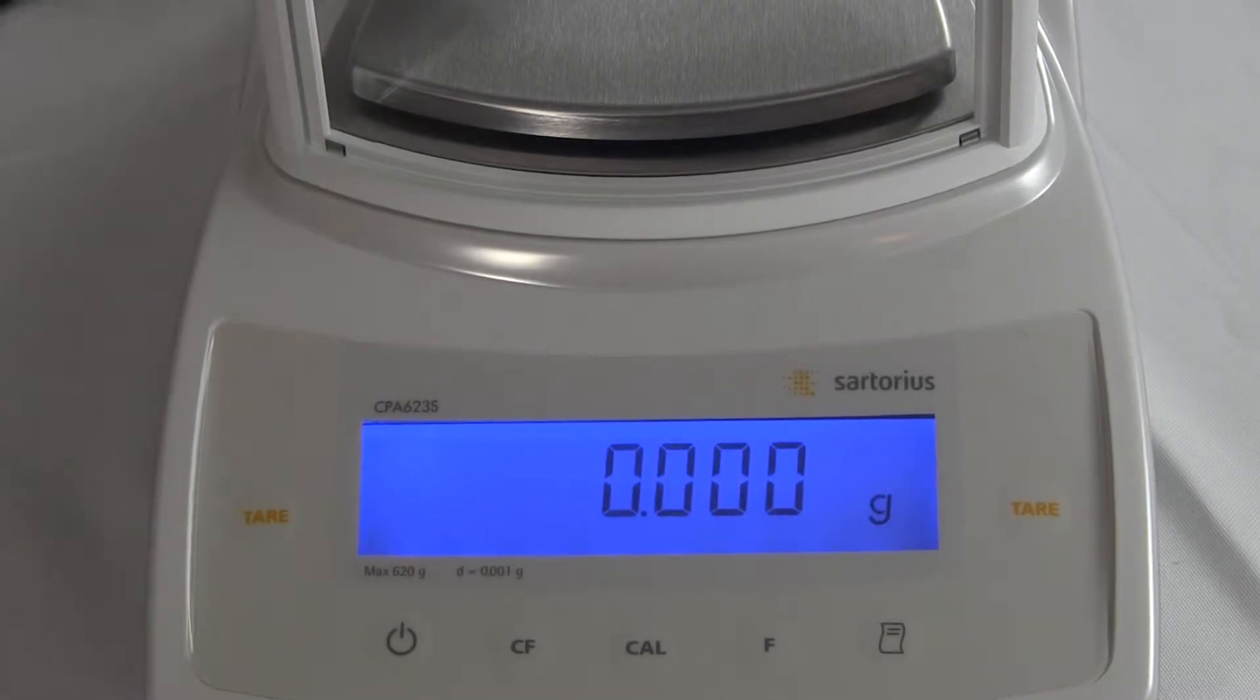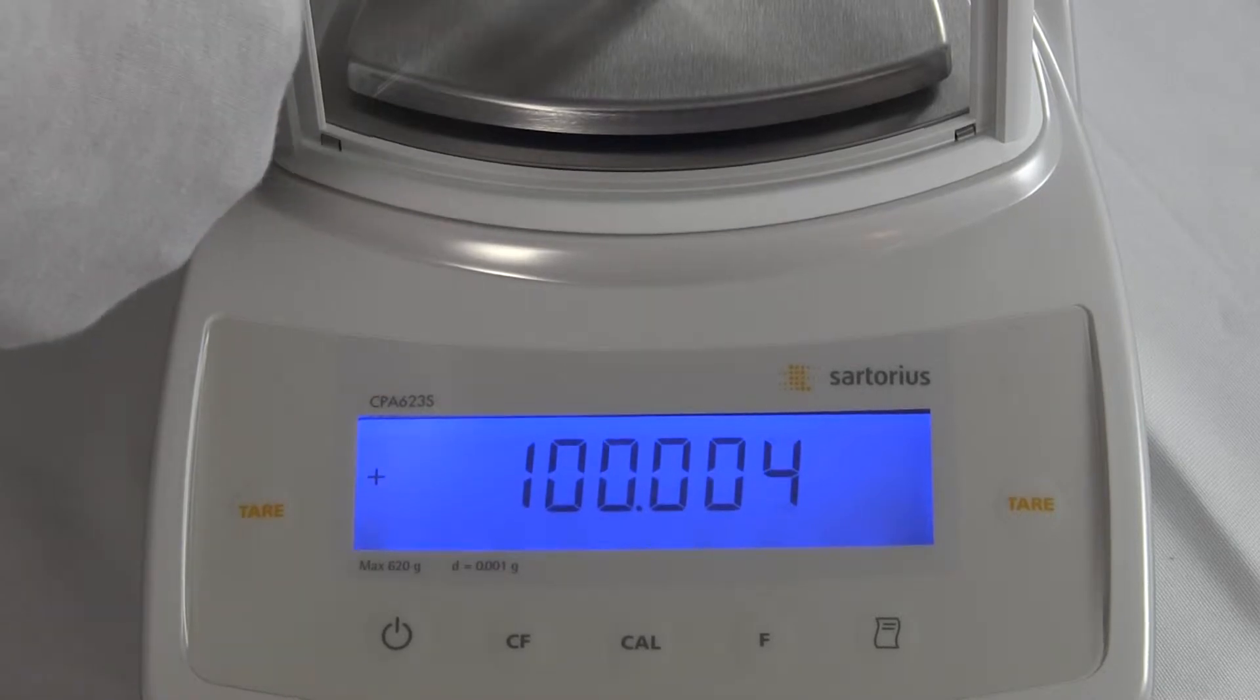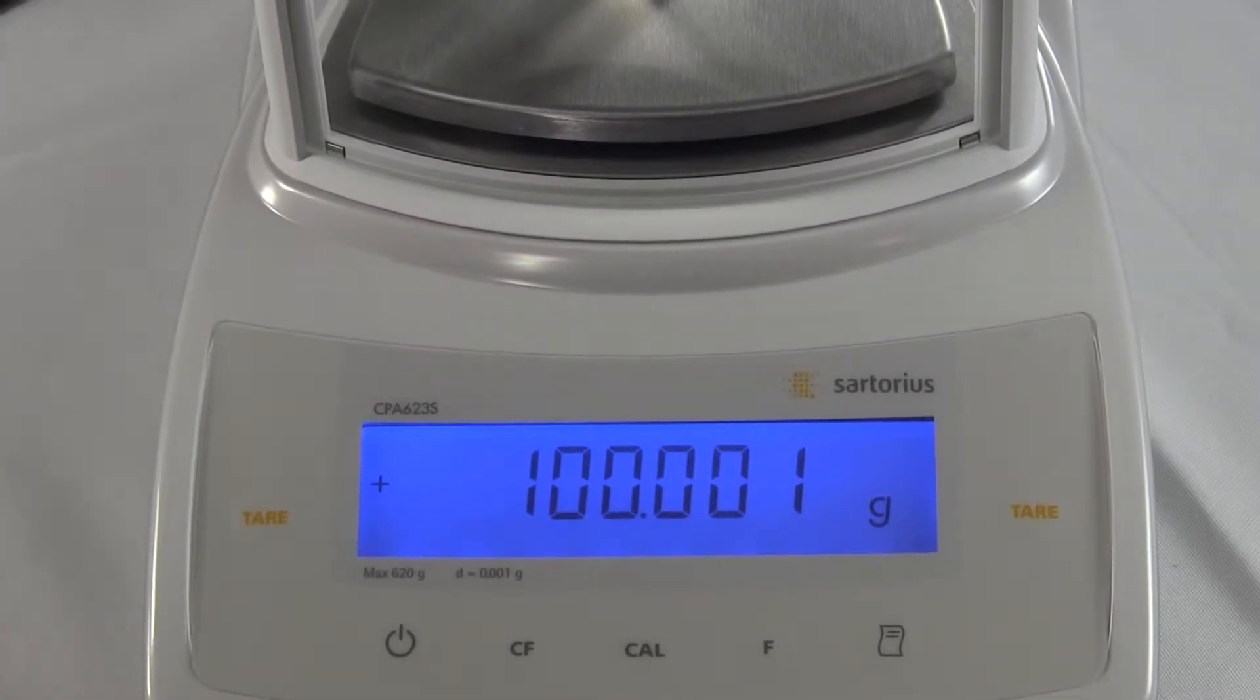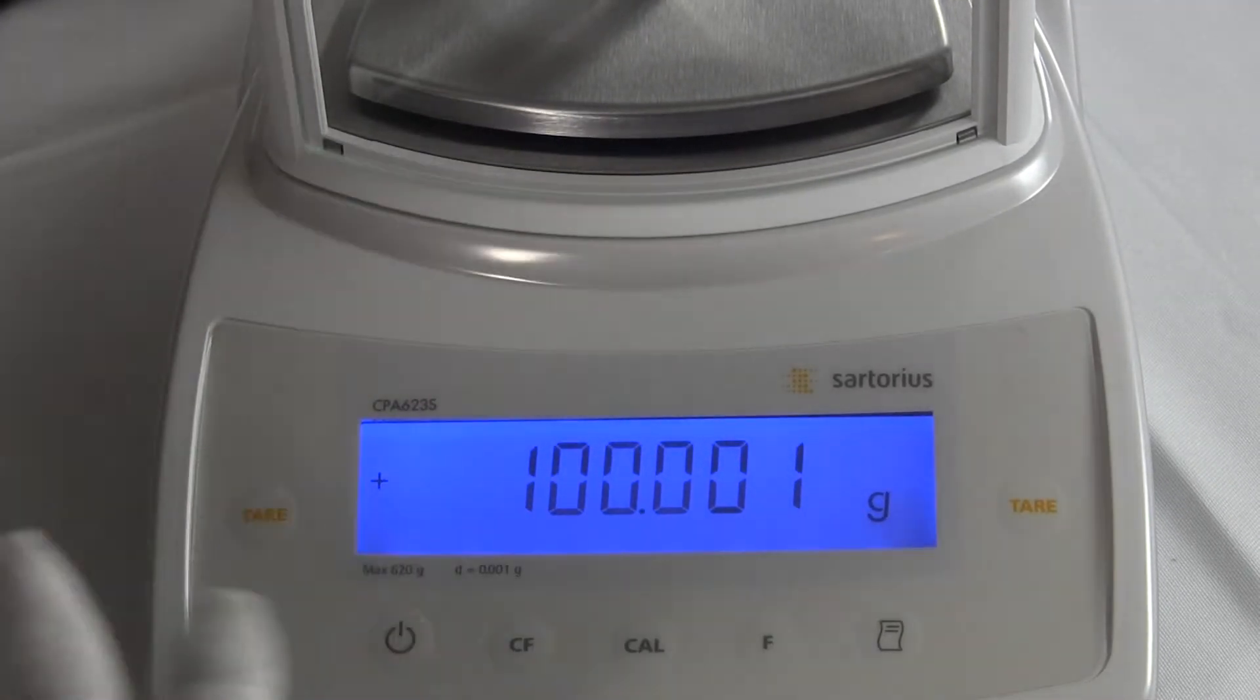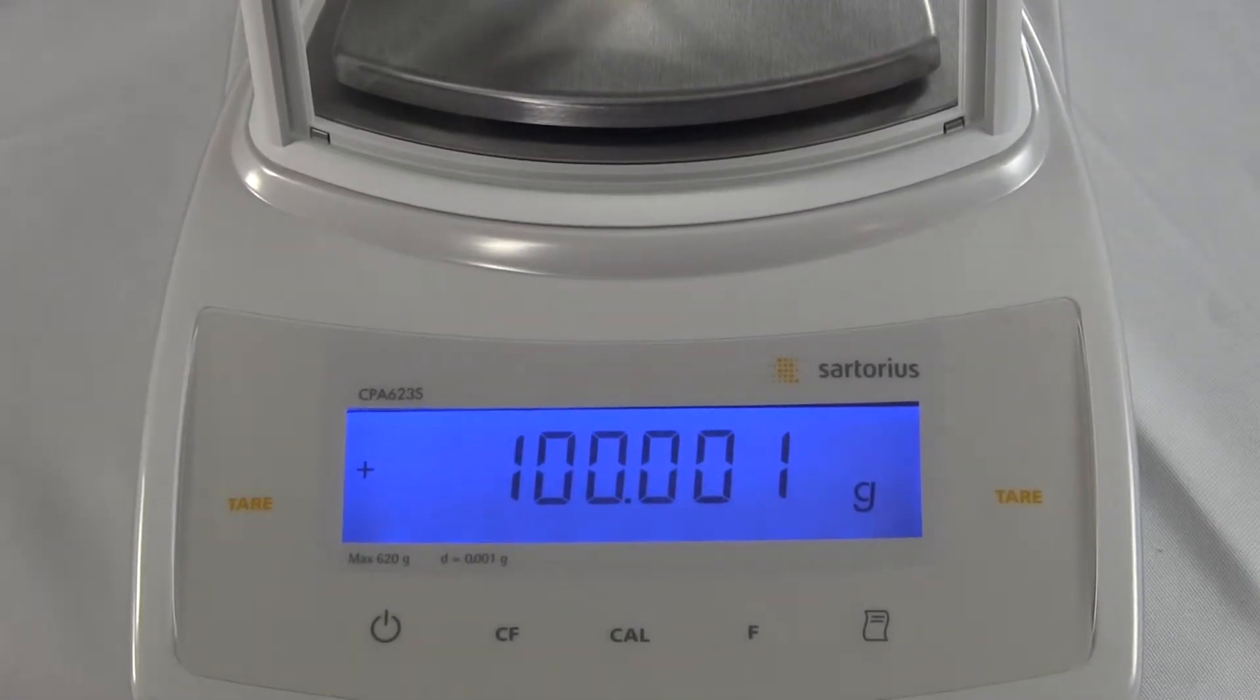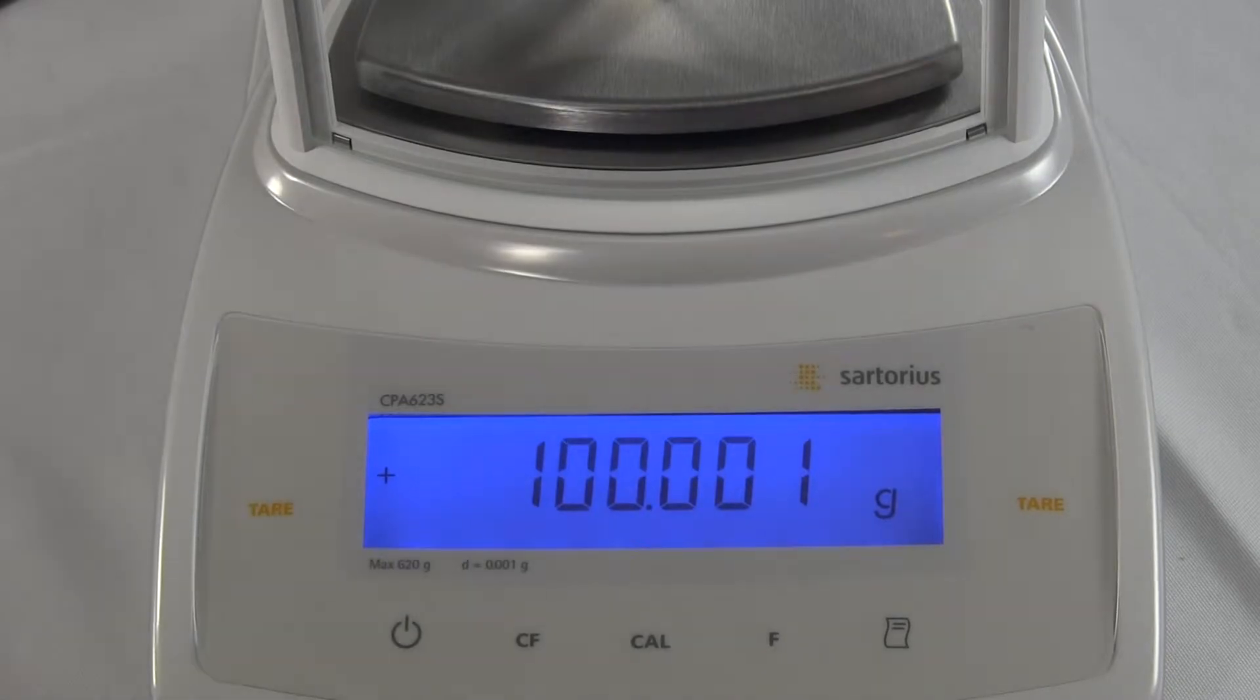We'll take a 100 gram weight, place it on the platform. And you'll notice the performance of the Sartorius. Stable. There's no other balances, especially all the stuff that's coming out of China, would be drifting all over the place. You'll see the numbers start to climb.